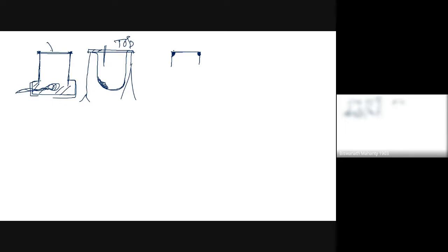Rather, we can always have a bigger angle. Maybe 120. Even so, you can try to make it smooth and 120 at least. Here also you see, if it is glass, nothing will adhere there. So it's very easy to clean. So this hemispherical glass is fine.